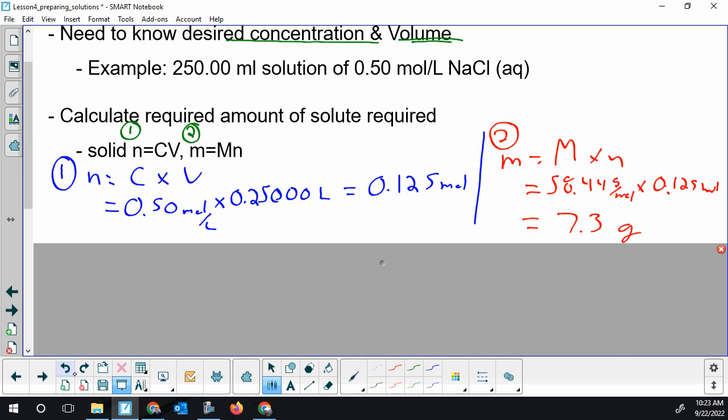So if you could weigh out about 2 grams, 2.4693 grams, you can get 5 sig figs on your mass of solute without too much difficulty. They're very expensive scales, but it's not hard to use them. Okay? And the glassware can do 5 sig figs. You can get concentrations of 5 sig figs. So you would first weigh out about 7.3 grams.